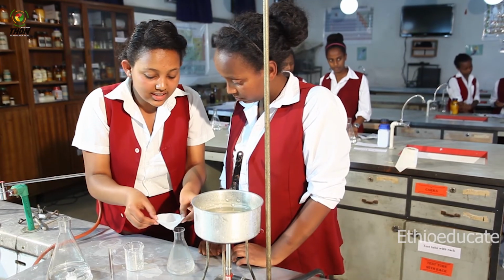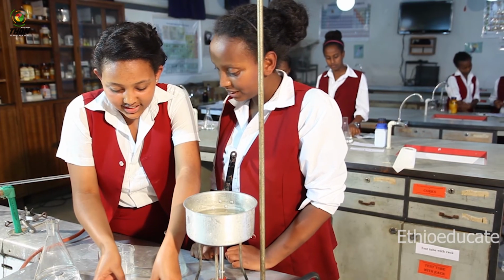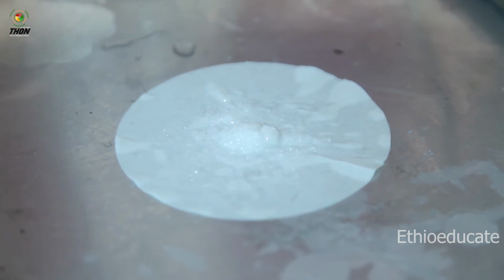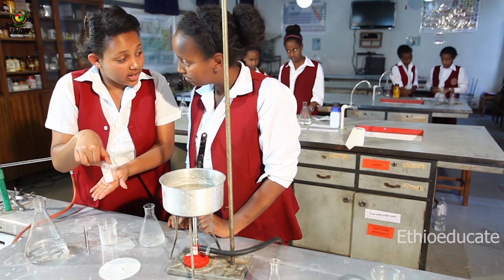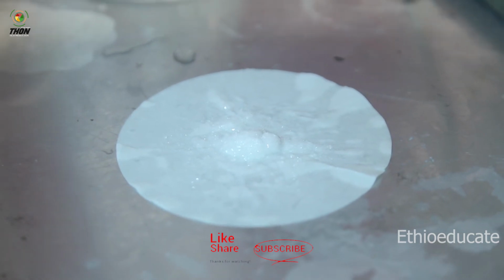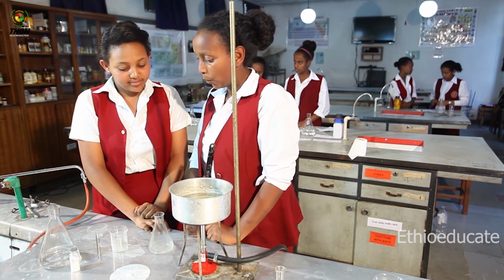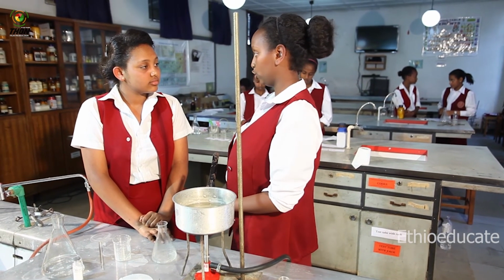So as you can see, Redate, we have got pure benzoic acid here. Yeah, very impressive. Yes, on the filter paper we have pure benzoic acid. What's the difference from the earlier benzoic acid? This is purified, and this, what I had first, was not pure, it was impure. And now it's pure. Yes. So what's your generalization from this experiment? Well, recrystallization is one method of purifying solid compounds.